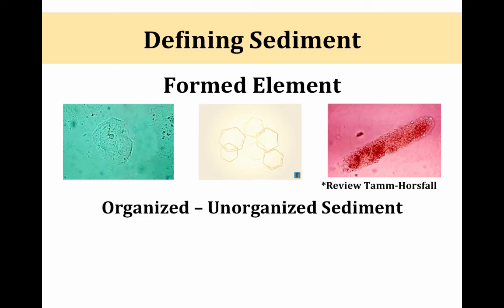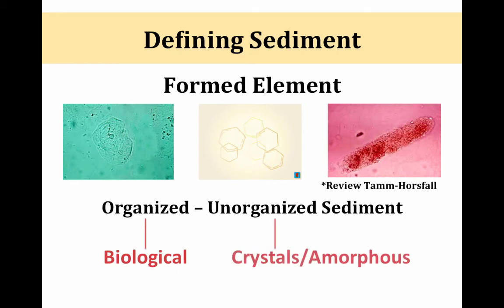And in general, organized sediment is usually biological, so that would be more like squamous cells, versus unorganized sediment are things like crystals, or in particular amorphous crystals that don't always necessarily have a set shape.